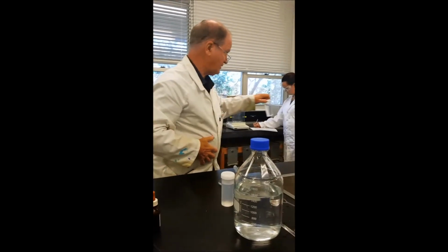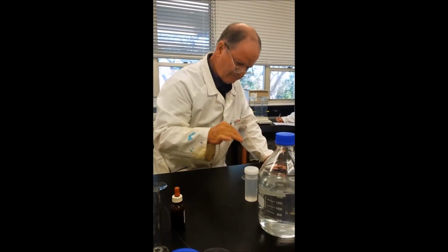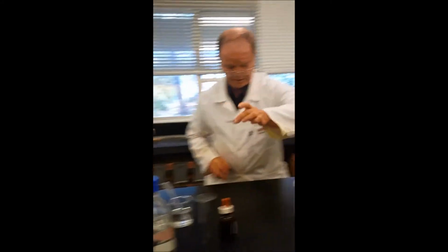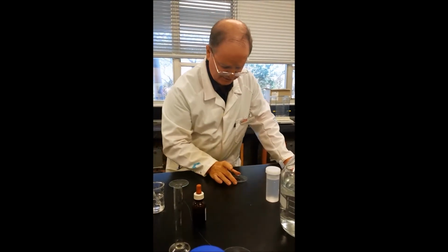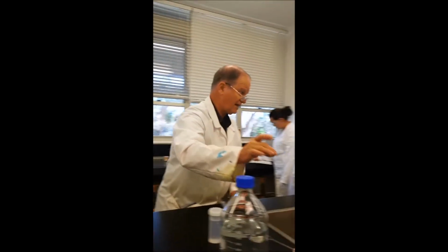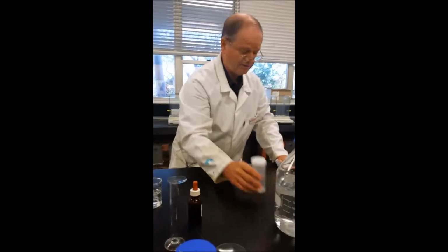Now, who looked after phenolphthalein for me? Okay, so we try one drop of acid, and it's clear. Okay. Now we get two drops of the base. So we've got to neutralise it, and then we add a bit of excess, and there it's pink. So you should expect to see that happen. Okay, see, not hard, just rinse it off. Next one, starch.